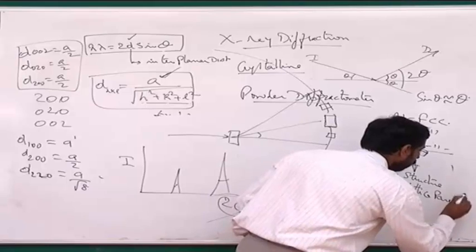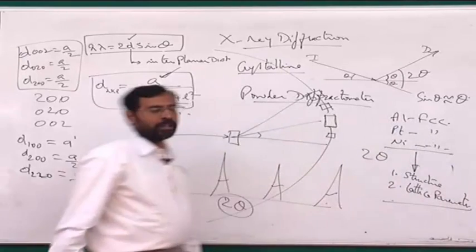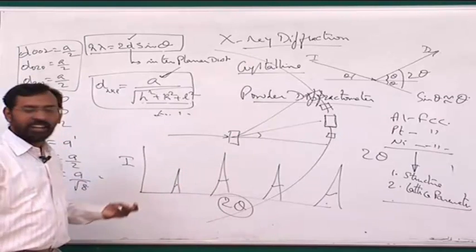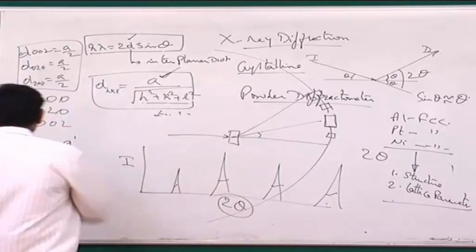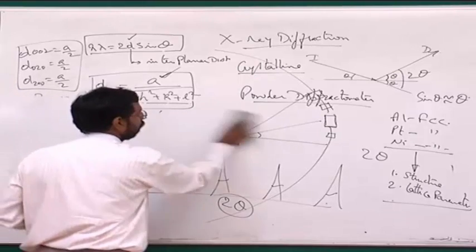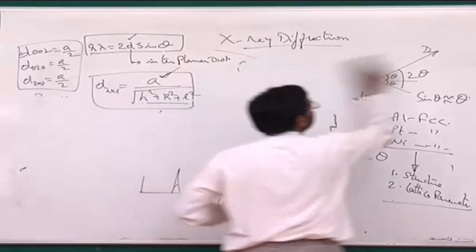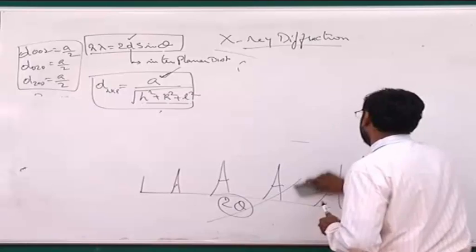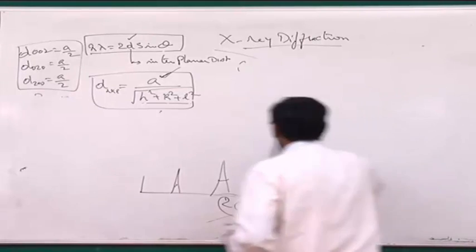So now the question is how to find this out. Can I use a diffractometer to do this? We say yes. How we do it is what we are going to see right now. To understand this, I need to know one more aspect which we have not introduced so far.